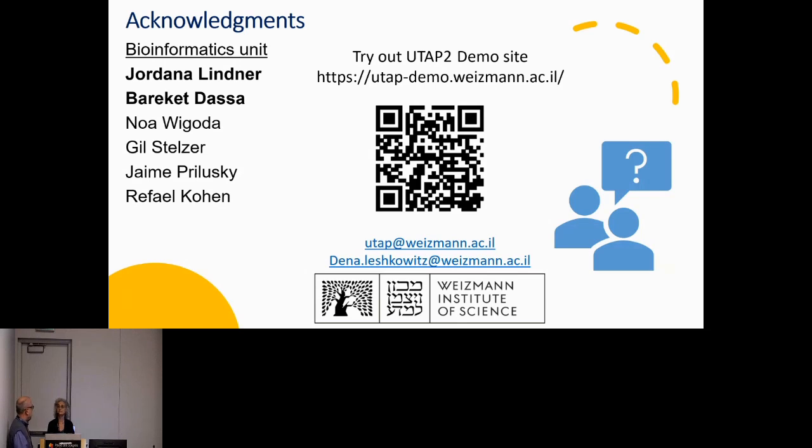Could you give us an idea of the number of users that you have using the system and how is the adoption? The adoption is very, very simple. Like I showed you, the interface is very simple to execute. Basically, we also use it in order to teach the students. It's part of our course. They can execute simply all these pipelines and explore the results. And so we have hundreds of users over the years, only within the Weizmann Institute. It's very, very popular because it is so easy to use.